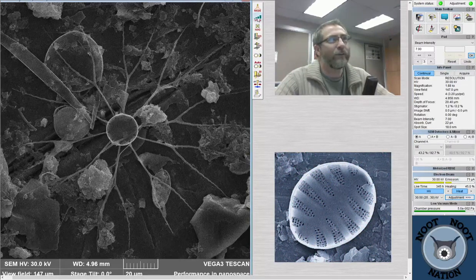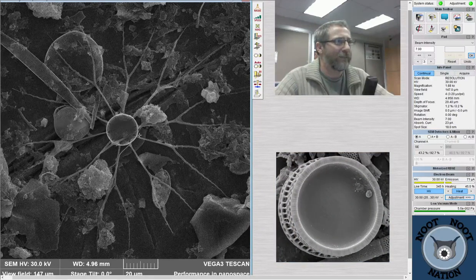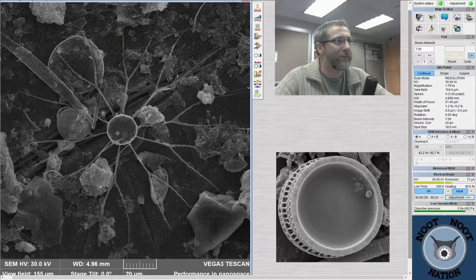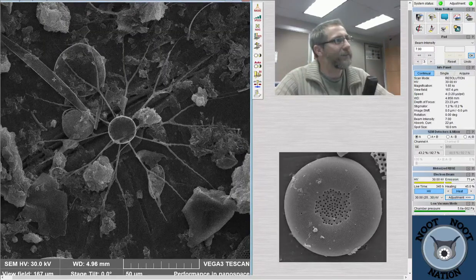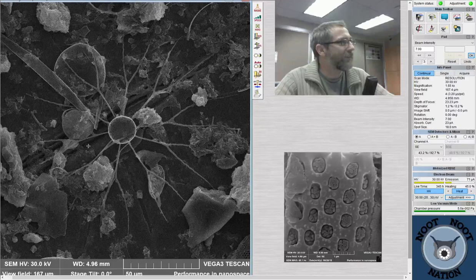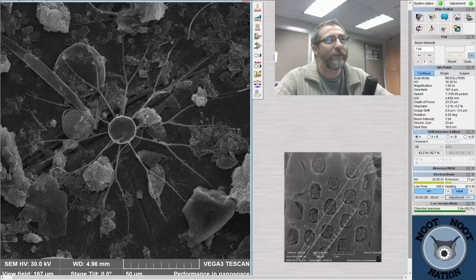So I'm going to go ahead and slow that one down and get a nice image from here showing the whole thing. I feel like maybe there's a little bit more of it, actually. Those setae are super long on this thing. What a cool looking diatom, though. That's a little Pseudo-nitzschia sticking its ugly face in here. And I think that's the Lauderia up here in the top, and a little Chaetoceros with its spines broken off down here. But that one is super cool.